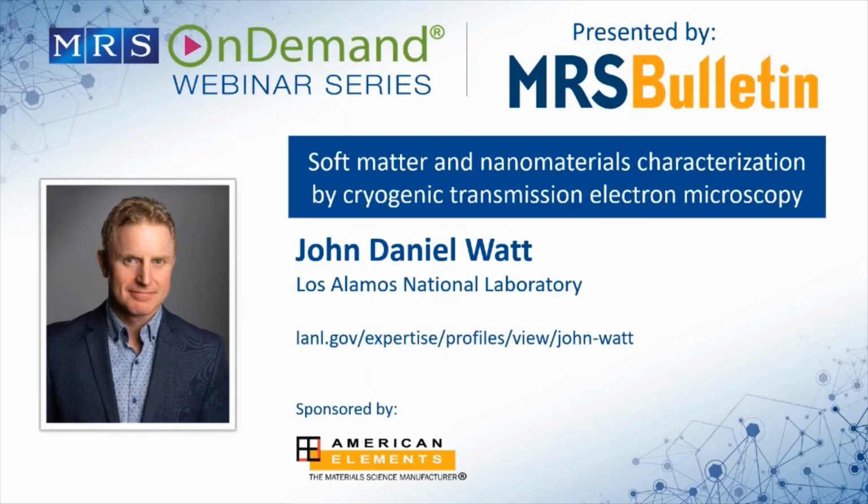And then you talked quite a bit about using cryo-electron tomography, and of course, that is really very much a developing field for our colleagues on the life sciences side. But most of their work has really been driven and has achieved the results using what they would call single particle methods. And do you think that the single particle reconstruction methods used in the life sciences have a real application in material science?